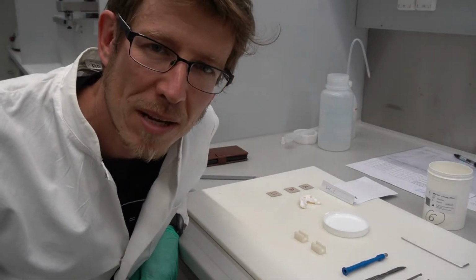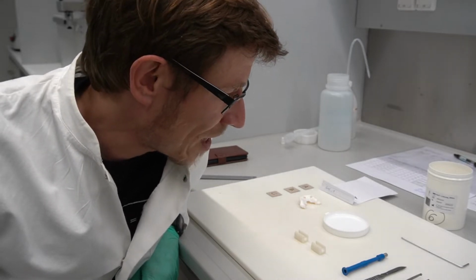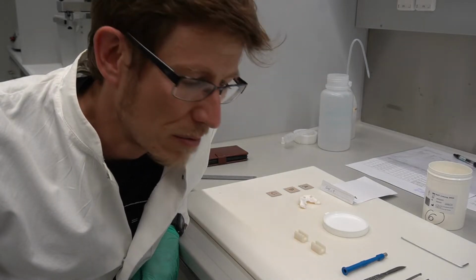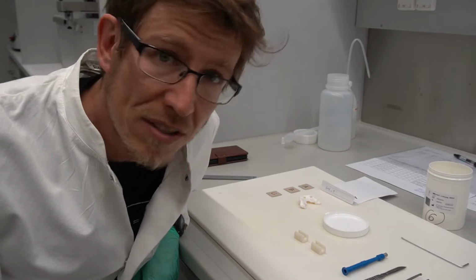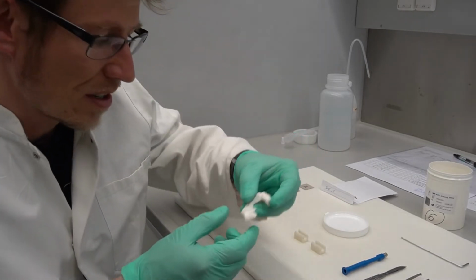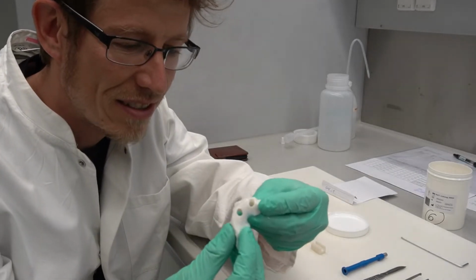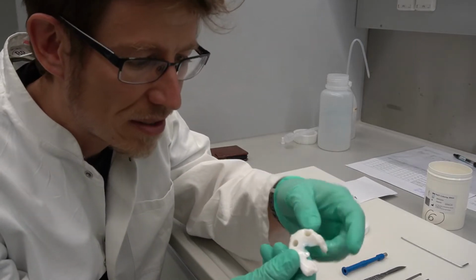I'm today in the BM lab at the Karl Landsteiner University in Krems, and I'm conducting a small project myself, which is about measuring the viscoelastic properties of meniscus tissue. The meniscus is the soft tissue part in your knee. This is a meniscus of a pig, which already has 2 samples punched out of it.